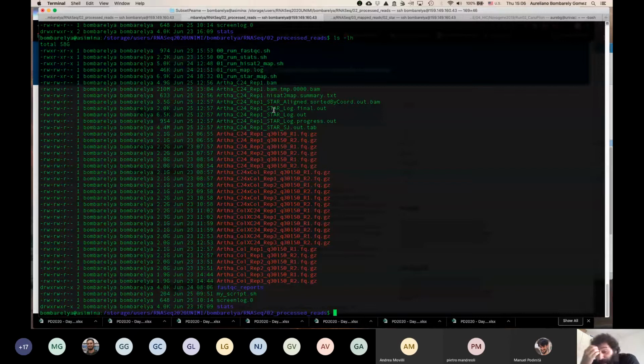Of course, now most of the people that do PCRs have these kits in which you only need to mix 3 things and it's all, no? Everything is mixed there. So there is really a technical improvement in the kits, even if the PCR is the same. With bioinformatics pipelines, it is the same. At some point, you have a pipeline, and some people use some algorithms, and maybe a mathematician develops a new algorithm, and then there is a bioinformatics group that thinks, oh, that is great. Let's try this new algorithm to create a new tool, and you get speed, and you can even get sensitivity.